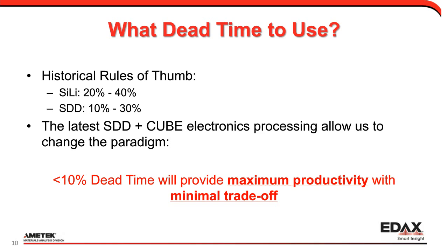We always want to work close to 100%, whether it's for our fuel efficiencies in our car or even our grades in school. The 100% is a target. So here in this case, we want to minimize the movement away from 100%. We want to maximize the productivity and work at the smallest dead time possible.